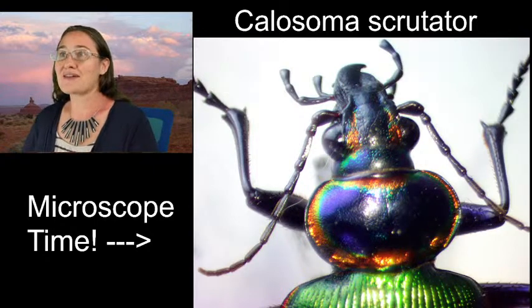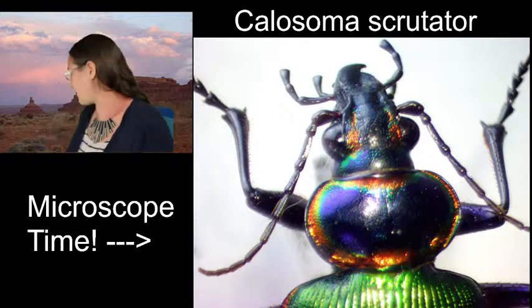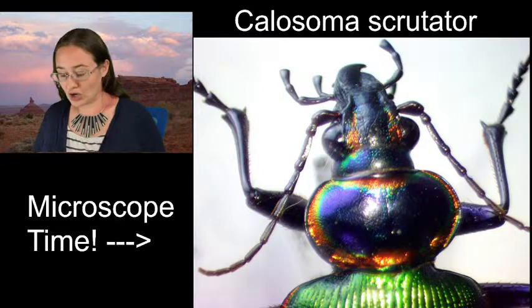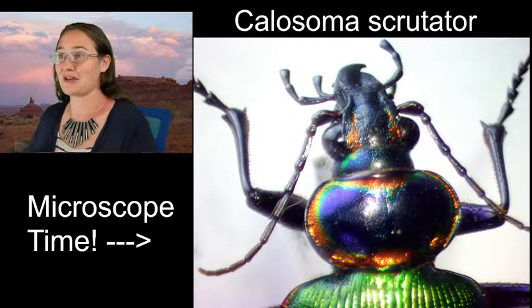I know that personally, I haven't identified my click beetles past family yet, but I did just grab the key for them. So, that's going to be something that I'm playing around with a little bit.